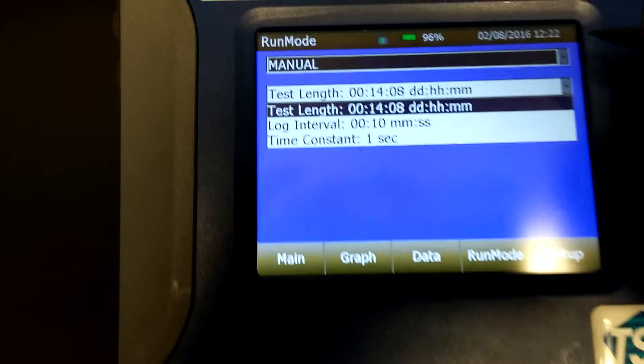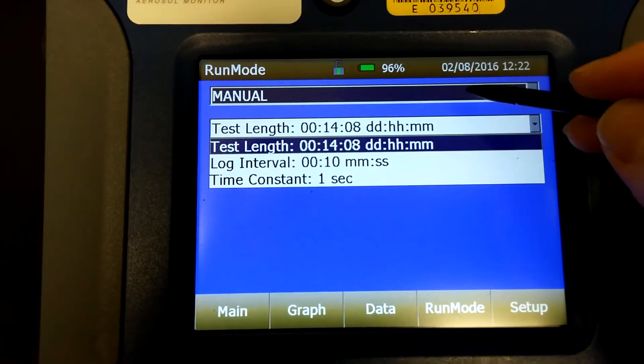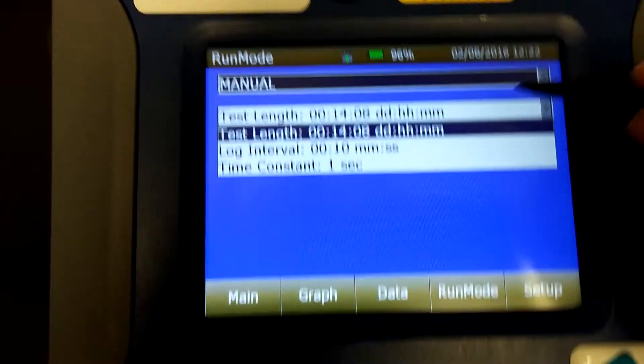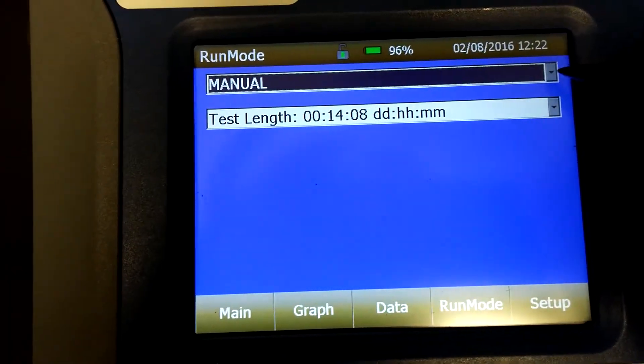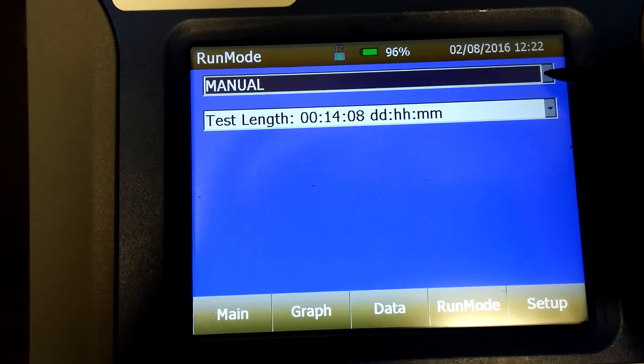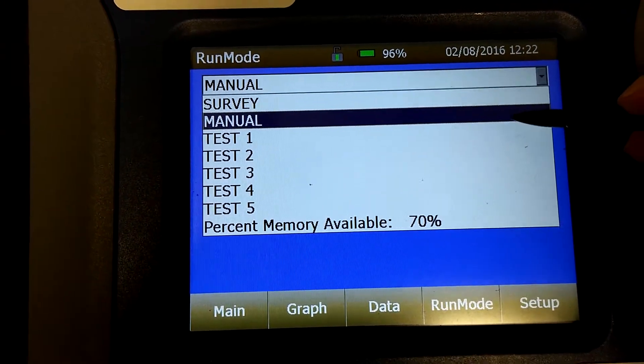Once in run mode, make sure manual is selected at the top. If not, press the right arrow to have a drop-down list to select it.